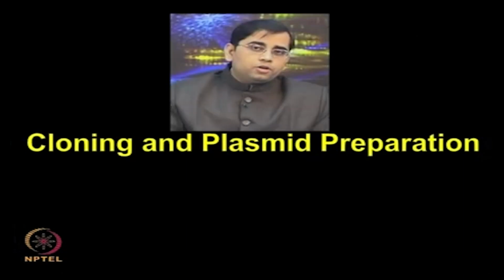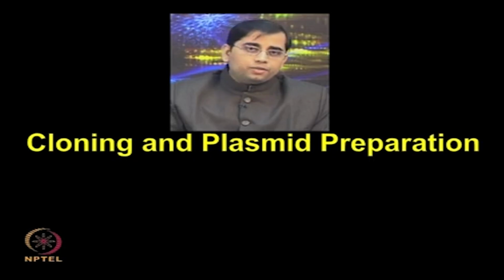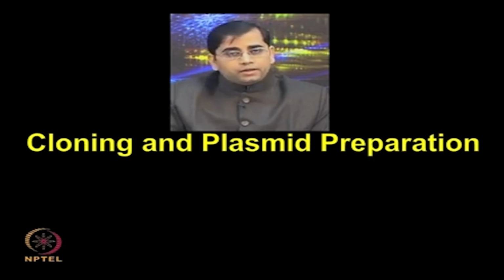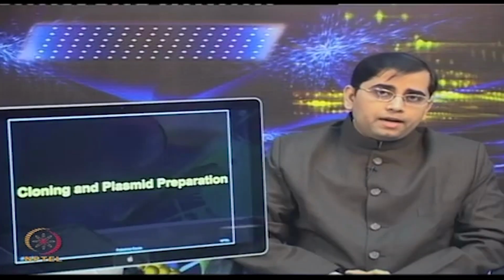So, let us talk about cloning and plasmid preparation. In the last lecture, we talked about recombinational cloning. So, researchers have started to create such collections of cDNAs by using recombinational cloning, which allows for the rapid transfer of DNA fragments from one vector to another in frame and without any mutation.